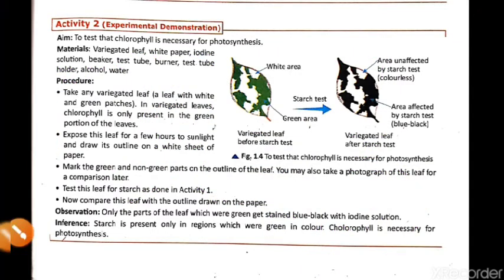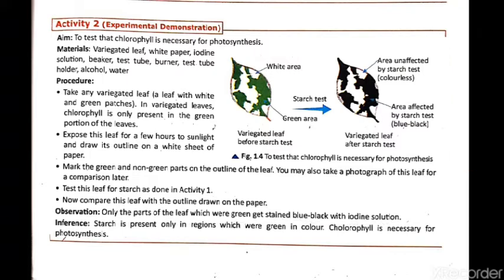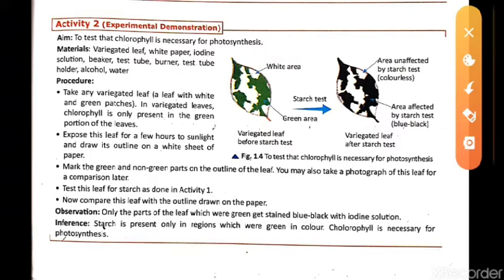So see what is written in the observation. Only the part of the leaf which was green gets stained black bluish with iodine solution. That means the white area, as pointed here, does not have chlorophyll or any starch. So the result is: starch is present only in the regions which were green in color. Chlorophyll is necessary for photosynthesis. So we have completed this one. We have got the result that chlorophyll is necessary for photosynthesis.